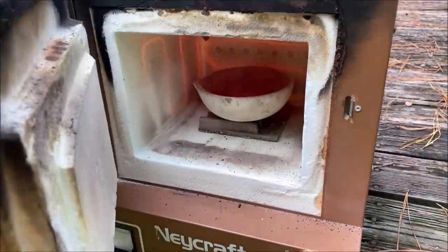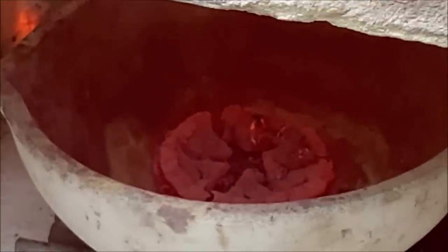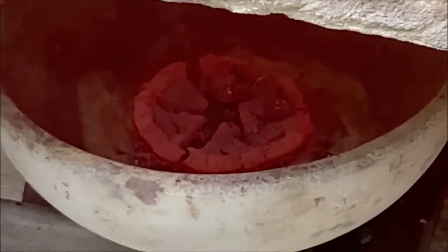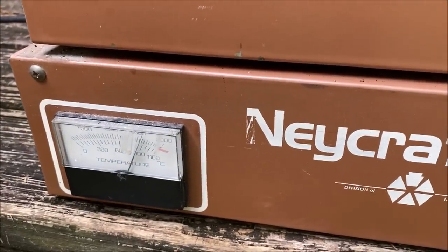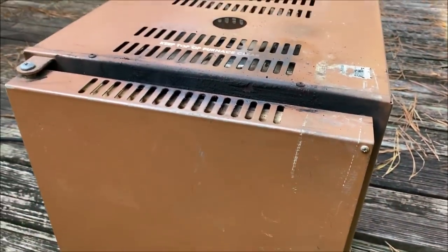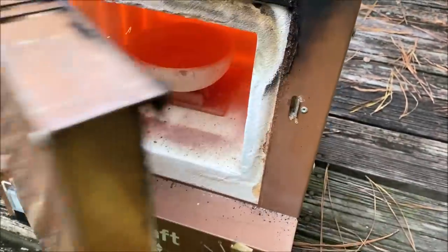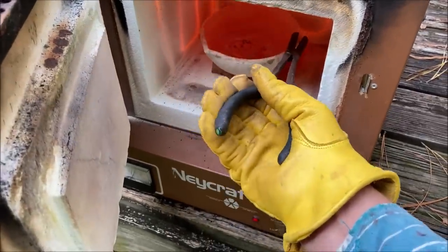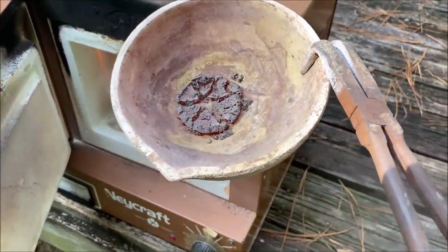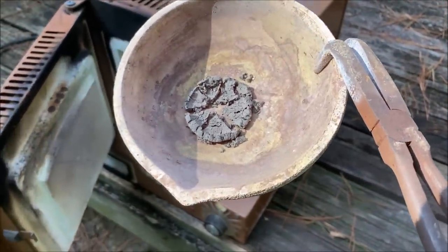And so now let's look in here. There's still smoke coming out of here. Oh yeah, look at that. If you look down in there, you can see it's shrunk. Not very much material left. We've got all of the fumes off of here. I see just a little bit of smoke still coming out. You can see it's nice and hot in here. Here's our solids. They've been burnt away to almost nothing.